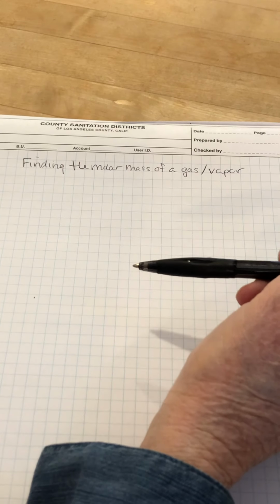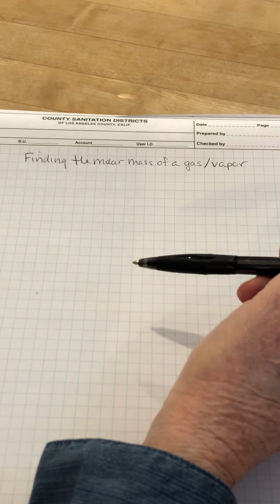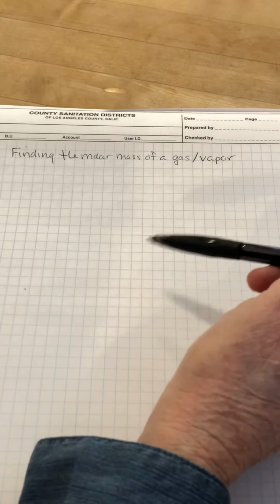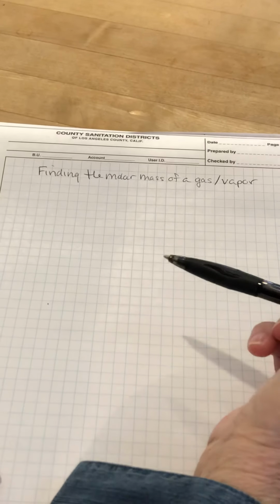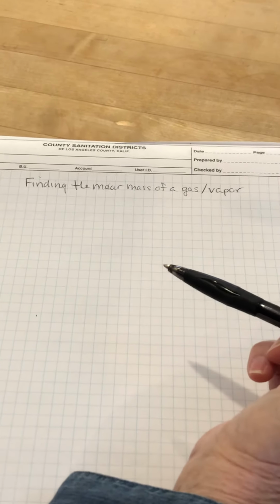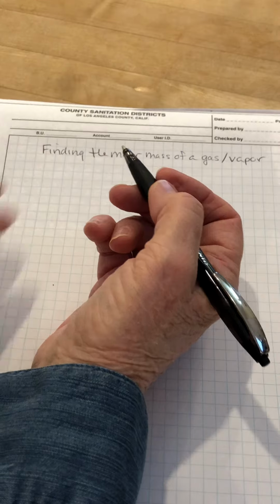You take it out. You would weigh the Erlenmeyer flask after drying the outside of it. And the difference between the mass of the empty flask, or the flask plus air, and the mass with the condensate in it, would be the mass of just the vapor at 100 degrees Celsius. It's a quick lab, we always do it, and we're not this time. But let's take a look at some data you might use.